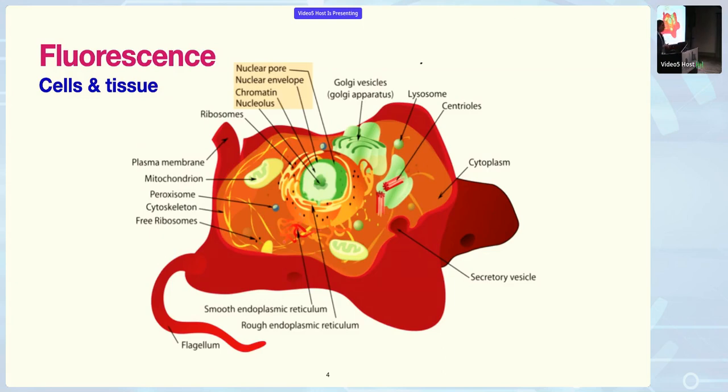And DNA studies are important. They are used for cancer research. So one of the most used cell lines is HeLa cells, which are cancer cells, but also in recent years for the development and discovery of COVID-19 vaccine, fluorescence microscopy was one of the mainly used techniques.